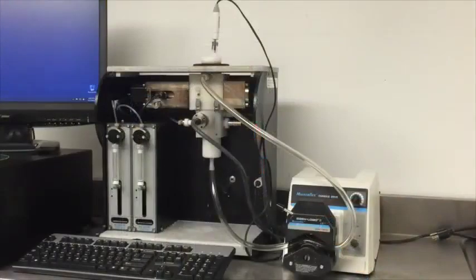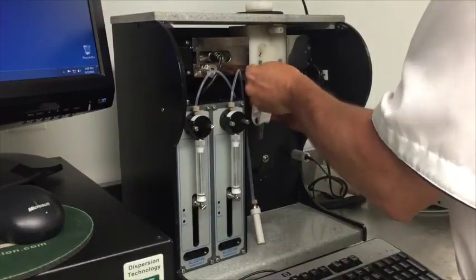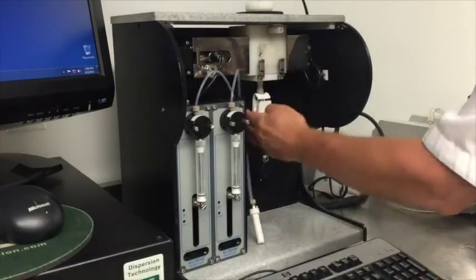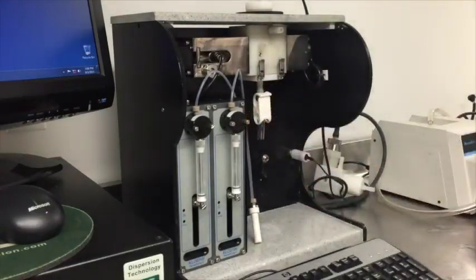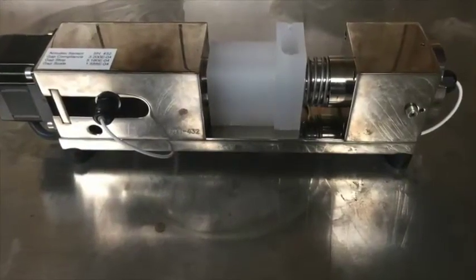Mixing is required only for samples that settle or for titrations. Otherwise, we can work with stable, stationary samples, which allows us to minimize sample volume and simplifies cleaning. It is convenient in such cases to work with different sensors individually. Minimization of the sample volume for acoustic particle sizing is achieved by using this insert, which makes sample volume around 15 milliliters. Alternatively, we can use the acoustic sensor as a standalone sensor with an even smaller sample volume, around 3 milliliters.